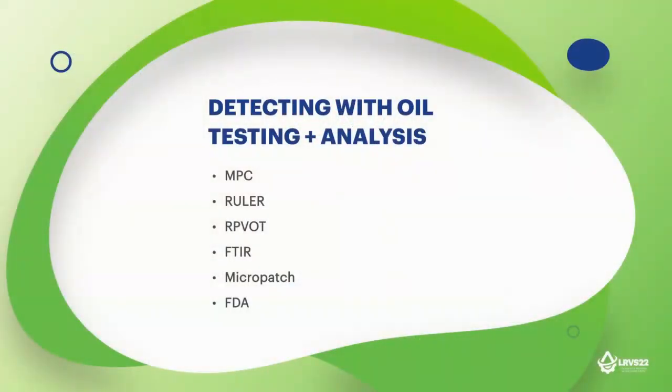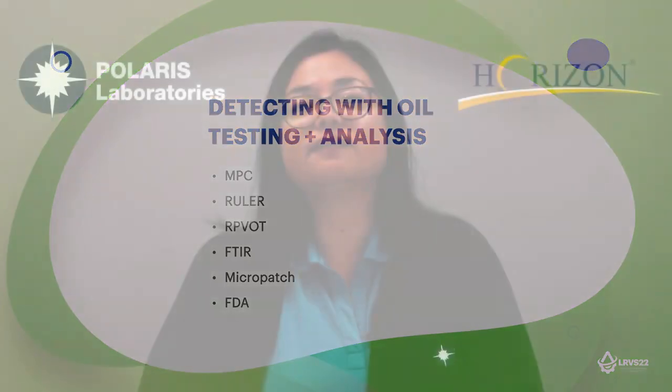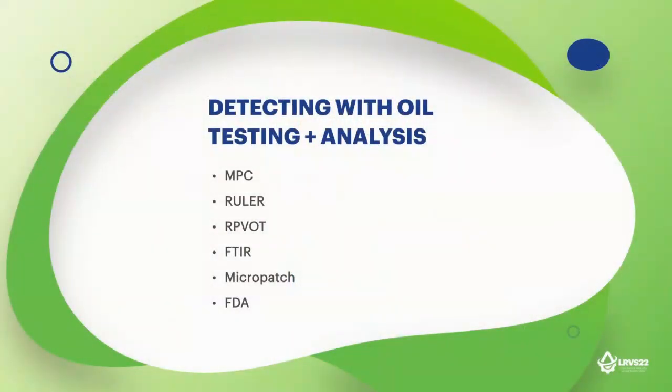The RPVOT measures the remaining useful life of the oxidation stability of the fluid. When you are at less than 25% of minutes, or remaining useful life, you will see a depletion significant enough that varnish would probably start to form at that point in time. FTIR analysis is very useful for detecting the degradation of phenolic content. In some formulations, the phenols can change in chemistry and become acidic. FTIR and RULER are very helpful in detecting that reaction that takes place in the lubricant.